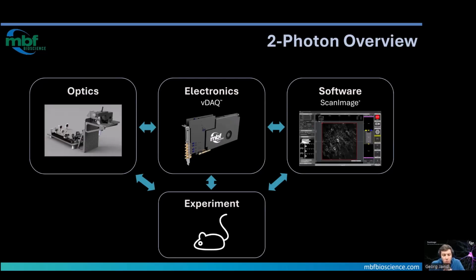And ultimately, all of these different parts are centered around a biological experiment, right? So all of these different parts need to work together to enable the biology that we actually want to investigate. So let's talk about these individual puzzle pieces in more detail.